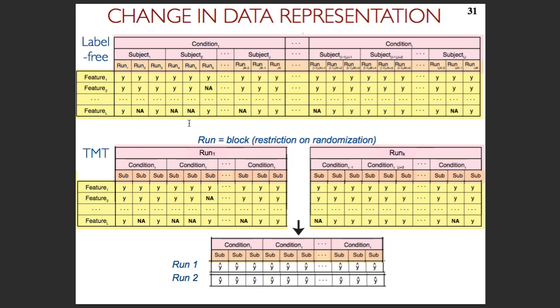But here you don't need normalization within the run, right? Because every row here comes from the same MS/MS spectrum. So for example, if an MS/MS spectrum was selected for fragmentation at the beginning of the chromatographic peak, it will have low intensities altogether, right? If it was selected on top of the chromatographic peak, it will have high intensity. So first row will have low intensity, second row will have high intensity. It's okay, because they were all within the same run.